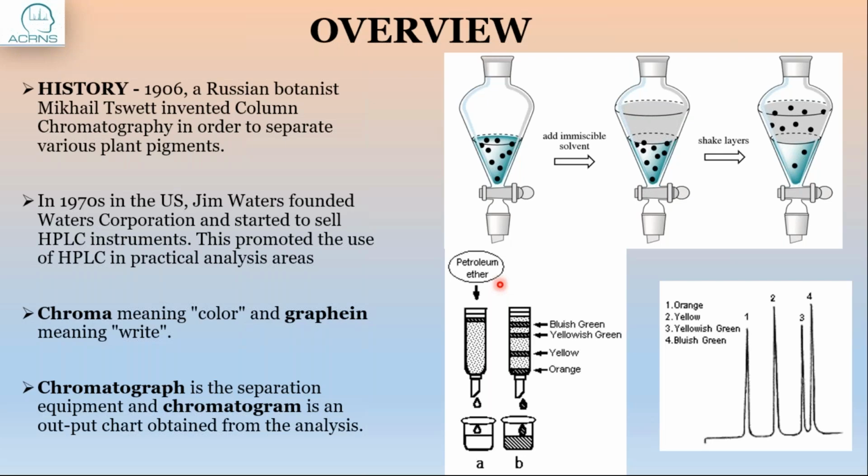If you see on the right hand side, these pigments are shown to be separated using chromatography. This is how a chromatogram looks. The outcome of chromatographic separation is presented on the right hand side.